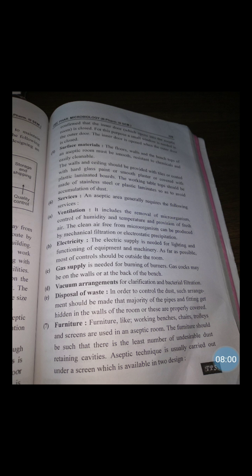The next is services. There are a few services: ventilation, electricity, gas supply, vacuum arrangement, disposal of waste, and furniture. We will see them one by one.